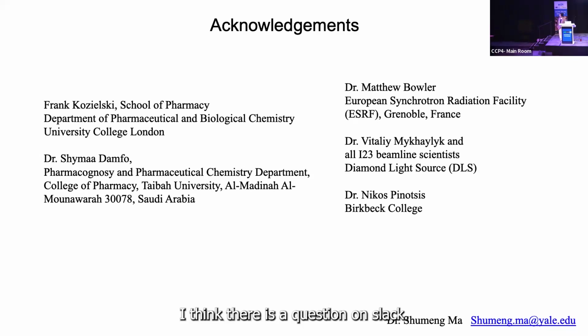Thank you. I think there is a question on Slack. Yes, it's more a general question about fragment screening. If the active site is deep inside the protein, can you still do fragment screening if your active site is rather buried?